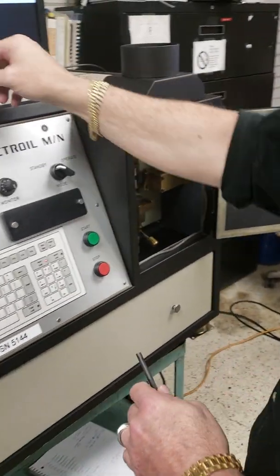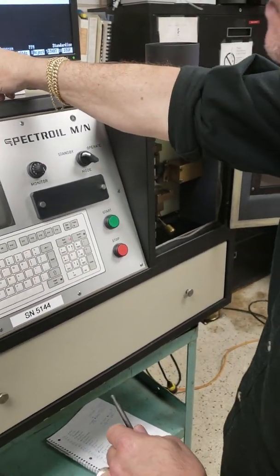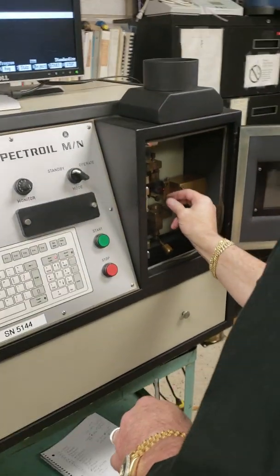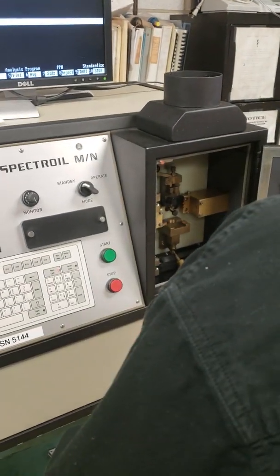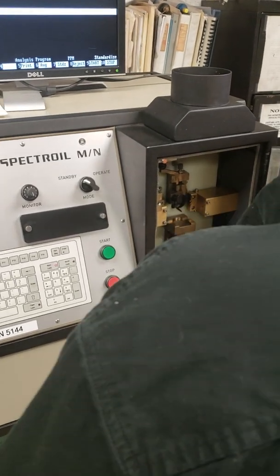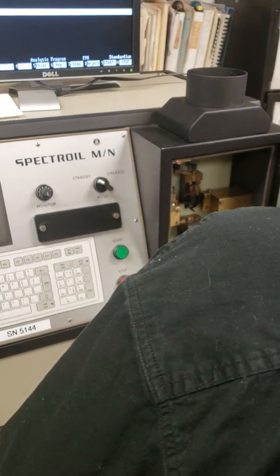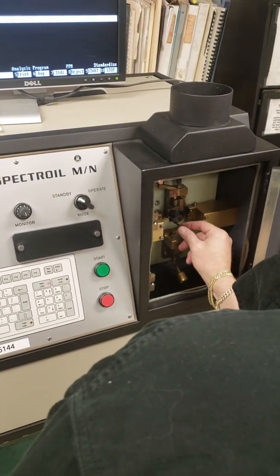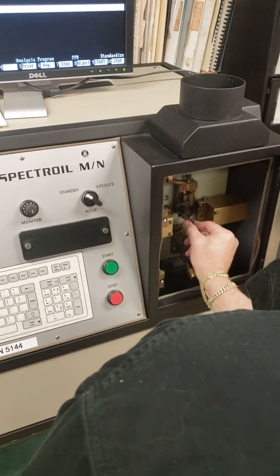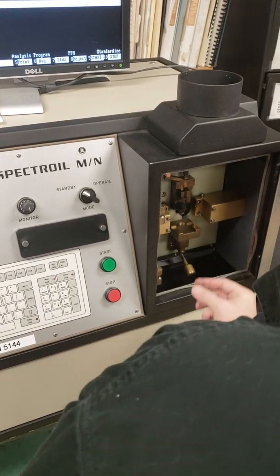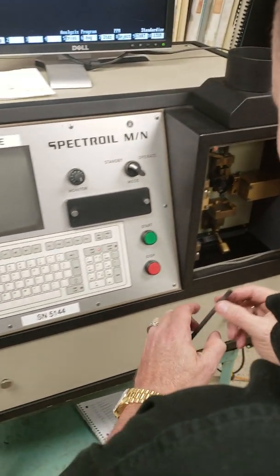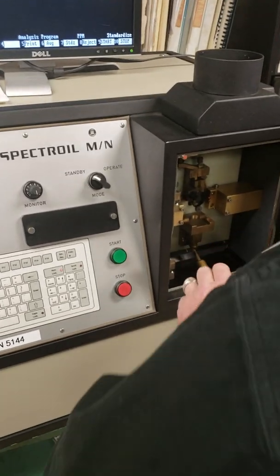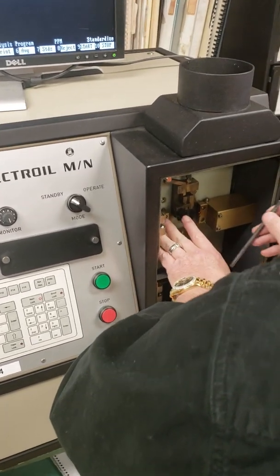What you want to do is open it up. We're going to put the disc on first. The disc goes in this little chamber — it just slides on right there. Push it on. Then you put your rod in. Make sure the rounded end is down.